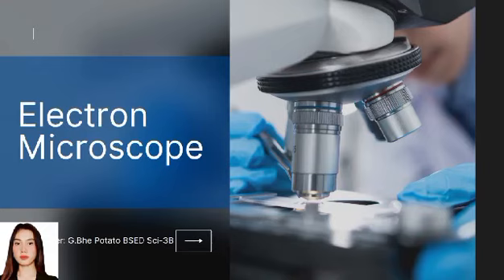So overall, electron microscopy is a powerful tool for visualizing and understanding the microscopic world. While it has its limitations and challenges, its unique capabilities have been instrumental in advancing a wide range of scientific disciplines from biology to material science.